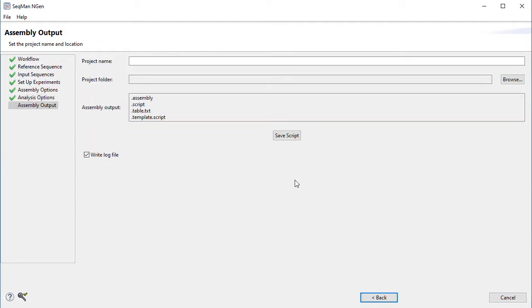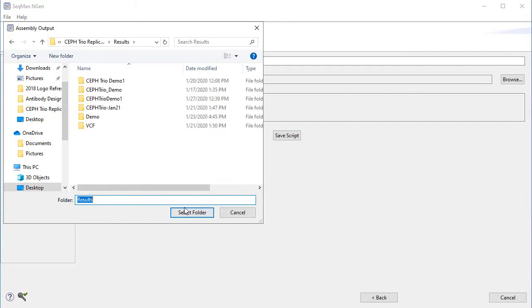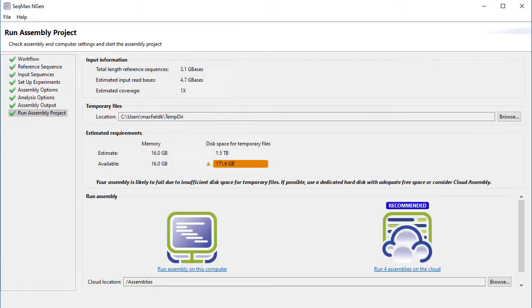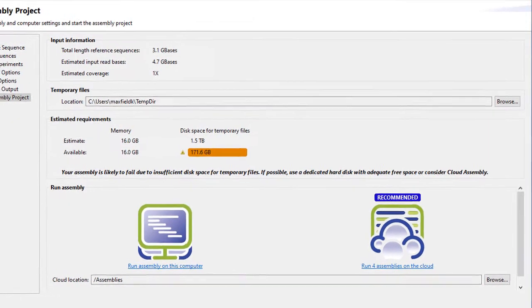Now, name your projects and set a project folder. Now, review the assembly information and estimated requirements.